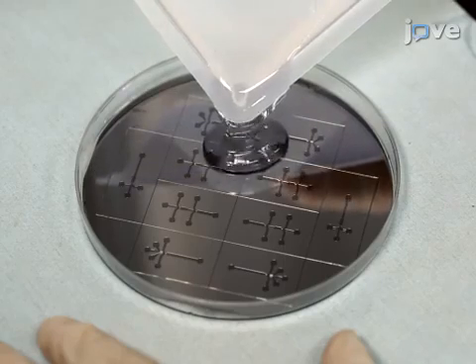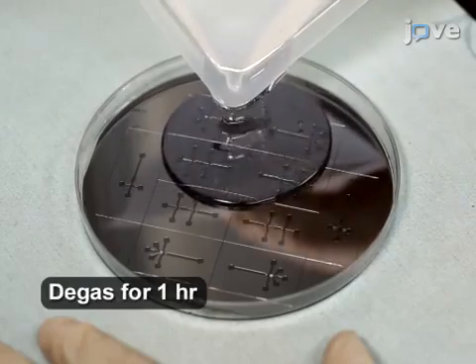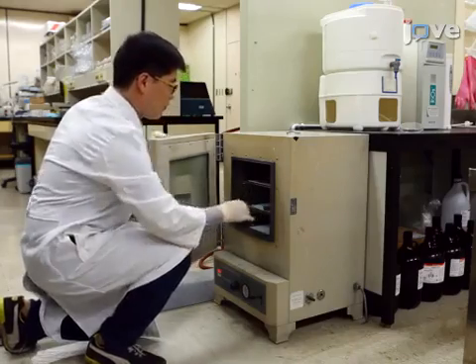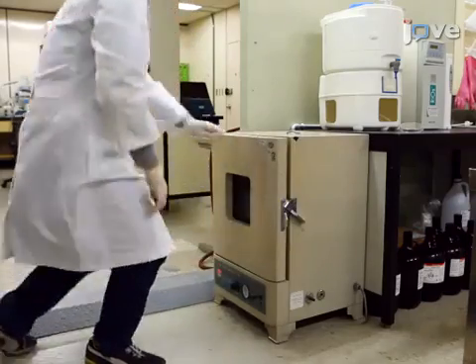Pour the PDMS prepolymer into the master mold and degas it for 1 hour in a vacuum chamber. Then, place the master mold with the PDMS prepolymer into an oven at 65 degrees Celsius for 3 hours.